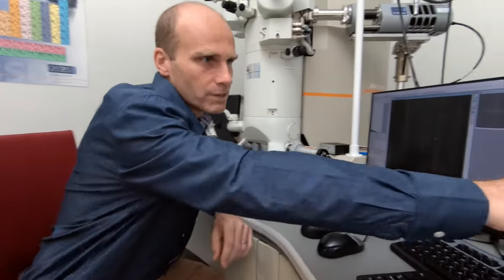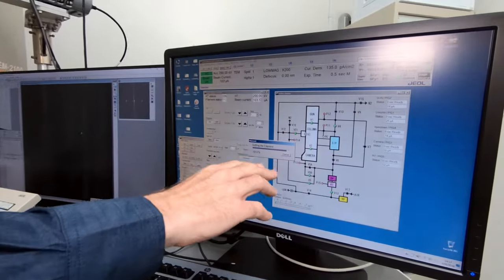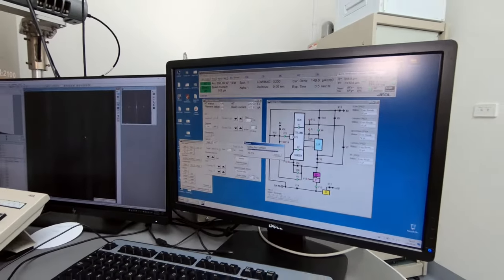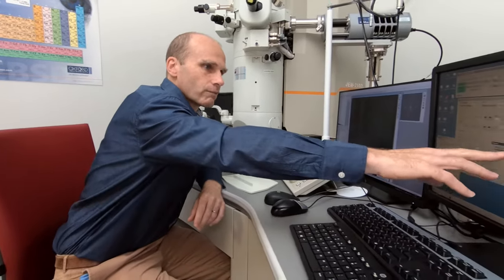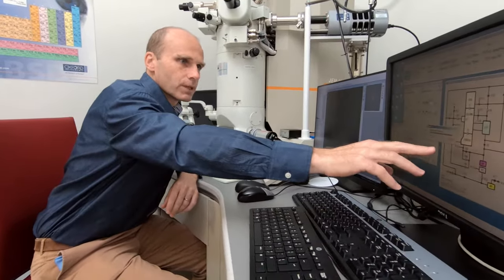Now you'll notice that it's taking a little bit of time. They've got a progress bar here which is slowly filling up. And the reason that it's taking this time is that the single crystal is fairly fragile. If it heats up too quickly, the thermal shock can cause it to be damaged and then we can't use our microscope. But in this case, the progress bar is just about filled up. Once that's complete, then we'll have a beam of electrons and we'll be able to investigate our sample a bit further.